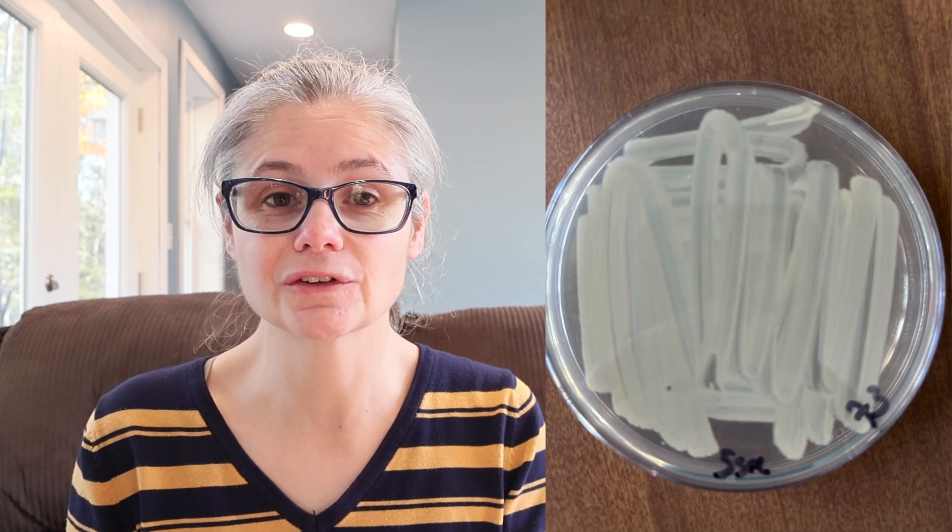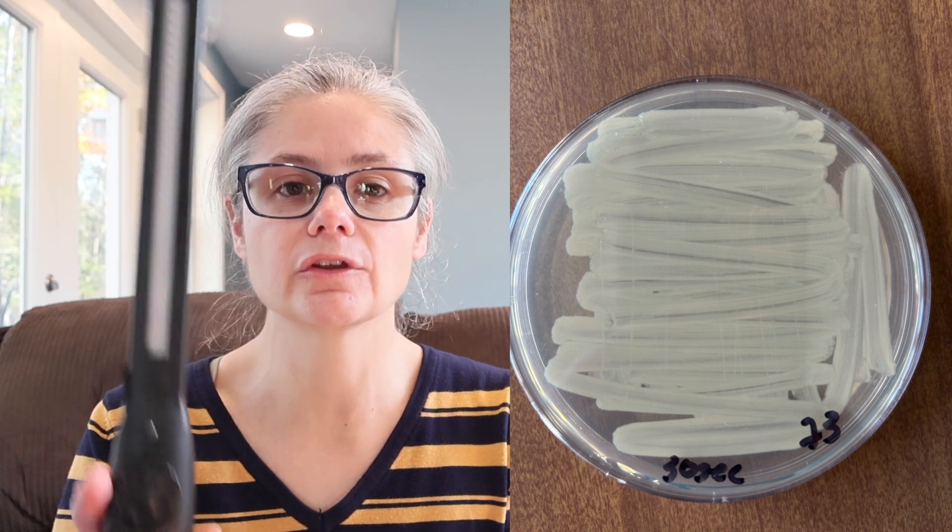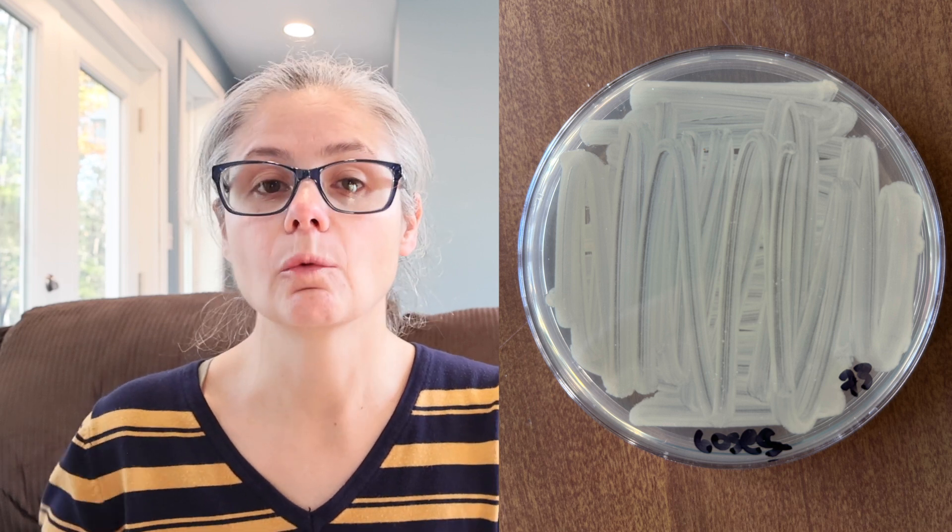Now for some results. Let's look at the results where I shined the UV light on a petri dish that has a lot of bacteria on it for 5, 10, 30, and 60 seconds. At the 5-second time, there's a lot of bacteria and the UV light did absolutely nothing to reduce it. At 10 seconds, again we see a full plate of bacteria with no decrease. At 30 seconds, still a tremendous amount of bacteria with no visible decrease at all where the UV light was shining. At 60 seconds, again a full plate of bacteria — no visible decrease at all.